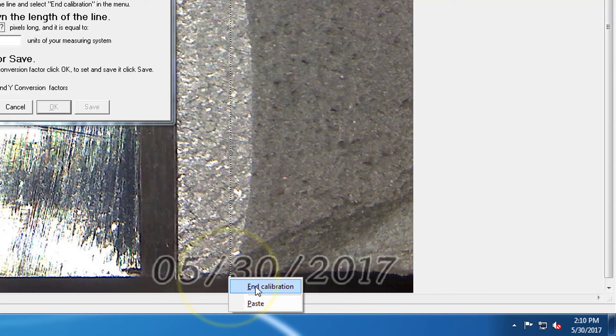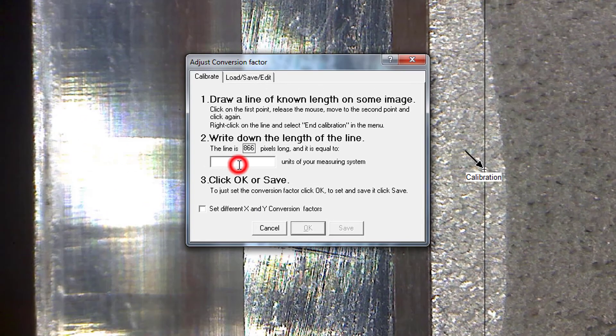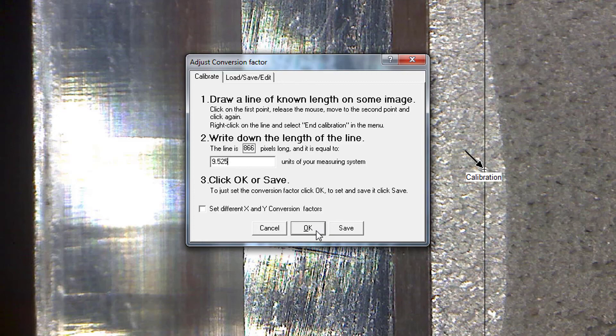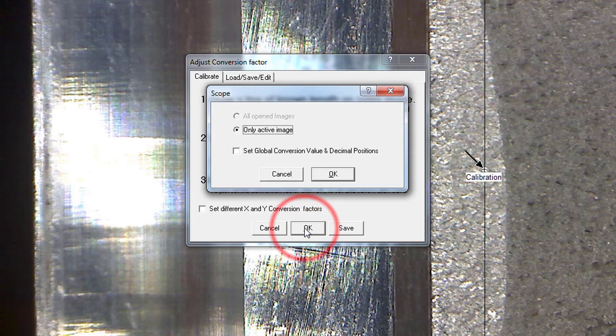With the cursor positioned over the last point, right-click to display a pop-up menu and select End Calibration. Enter the measured thickness of the specimen, in this case 9.525 mm. Click OK and then OK again.